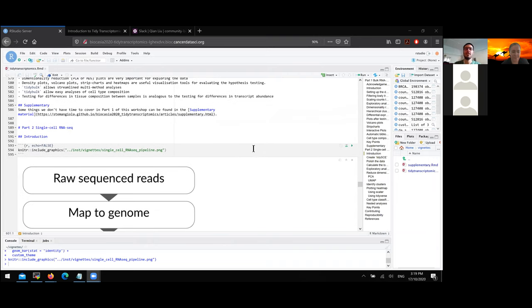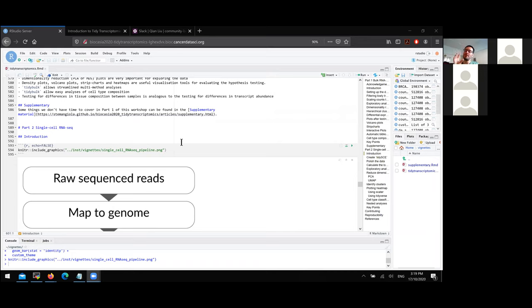We've talked about bulk RNA sequencing — now we'll step to single cell RNA sequencing. For this workshop I'll assume you have some knowledge of single cell RNA sequencing analysis. The goal is not to teach the analysis itself but to show you how you can analyze the same data taking advantage of tidyverse.